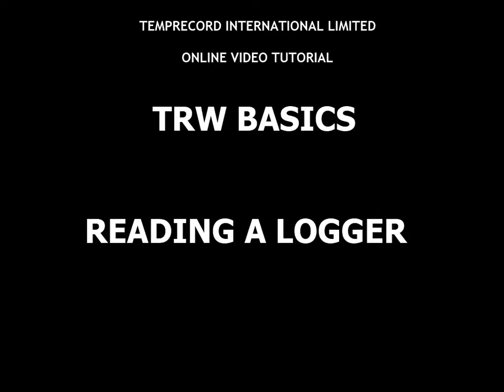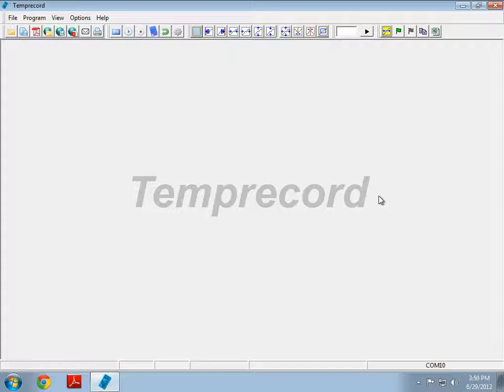In this tutorial we will cover the basics of reading a logger using the TRW software. My name is Luca Bartolitz and I'm the Research and Development Engineer here at Temprecord International Limited. Here I have the Temprecord for Windows user interface already opened up.